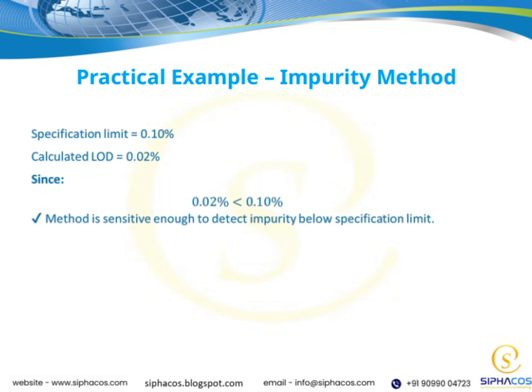In this example, we see how carefully separating impurities can lead to more accurate analysis, helping us make informed decisions about quality control or process optimization. So, this practical application highlights the core value of the impurity method, turning what might seem like contaminants into valuable insights that support our overarching goal of ensuring product integrity.